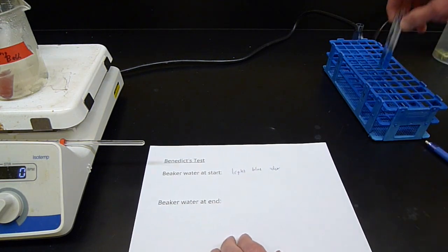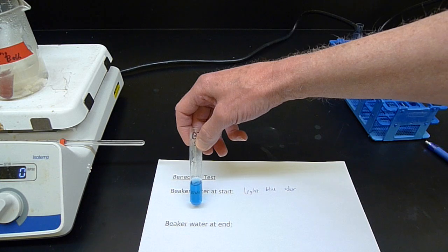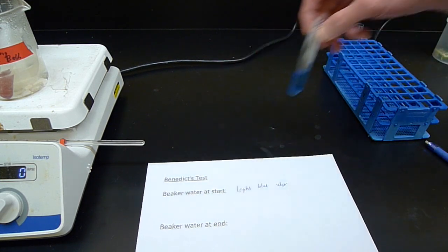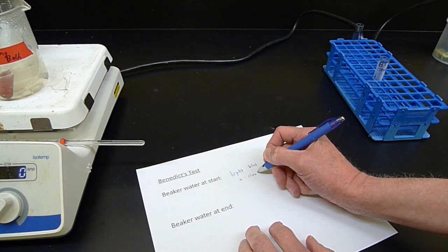And if we look closely, it's still fairly clear. You can see the lettering through the solution here. It's clear. There's nothing solid floating around in there. So I'm going to write "and clear."